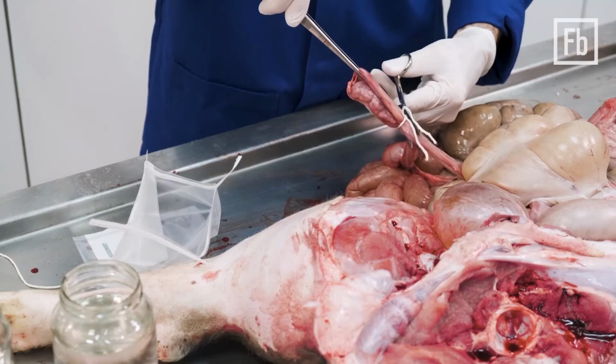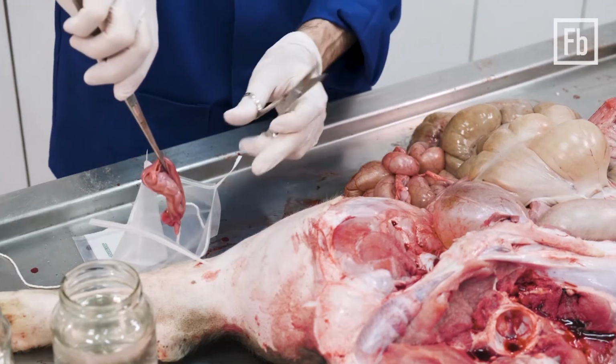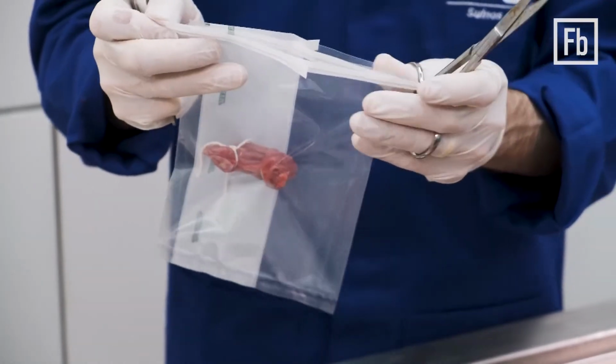For microbiological tests, collect 2 samples from the small intestine, 1 each from the jejunum and the ileum, and 1 from the colon. These should be approximately 10 centimeters in length and tied off at the ends. Samples should be collected from those areas where macroscopic lesions are visible. If lesions are not visible, the sample should be collected at random. If macroscopic alterations are observed in other tissues, include samples of these in formaldehyde for histopathological testing.